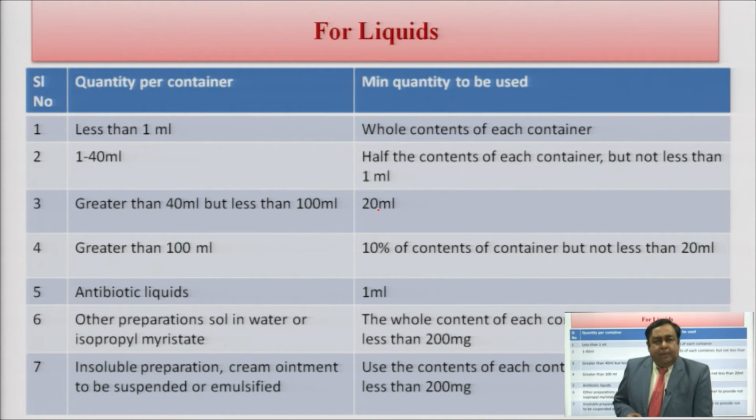Now, if the preparation which you are testing is an antibiotic in a liquefied form, the minimum quantity to be used is 1 ml of the solution. There are also many preparations which are non-antibiotic in nature.